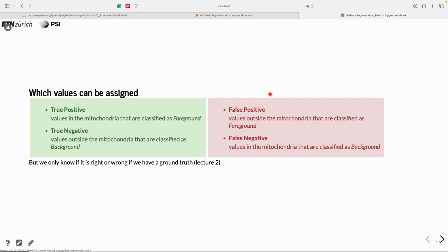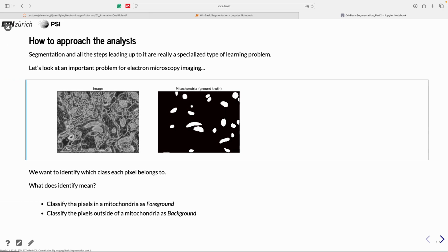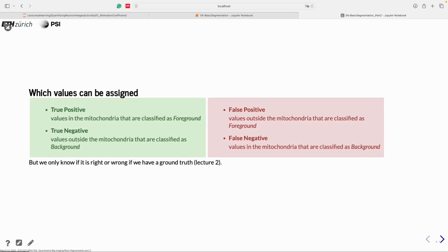And on the other side, we can also have false positive, that some pixels, and you can see back on this one, that you have gray levels that are very confusing. This is about the same as that. And you could have misclassification, saying that also this thin line is the mitochondria. And that would be the false positive.